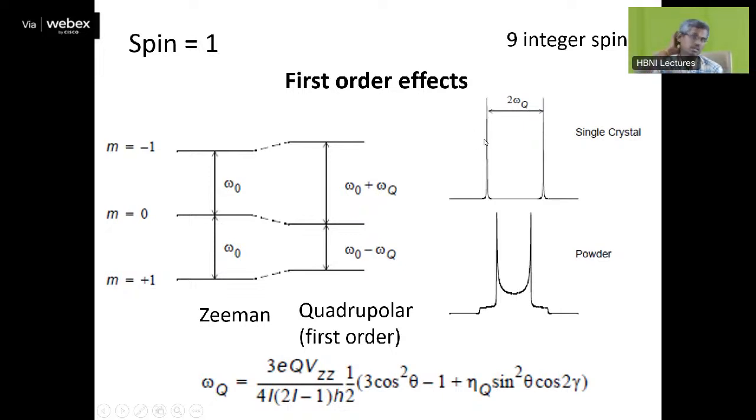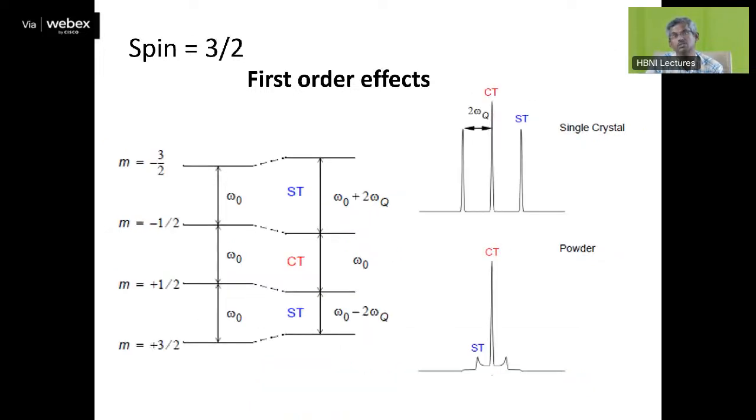So this is a straightforward concept which we are telling: whenever you see only one type of environment, for example an isolated molecule of proton, then it should be like this. The nuclear transition we should be able to see clearly.